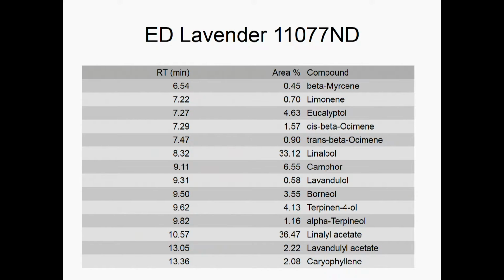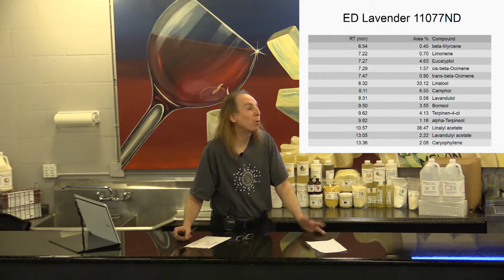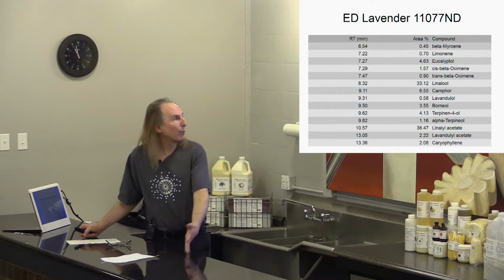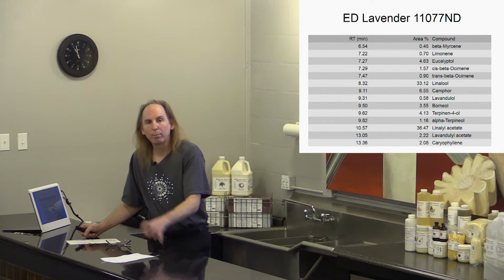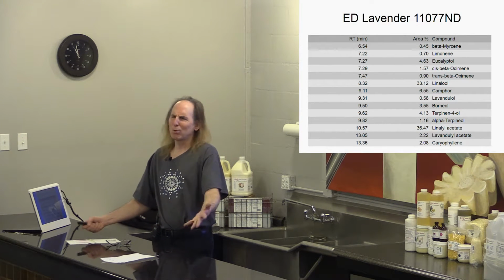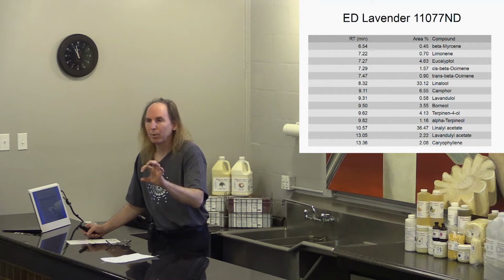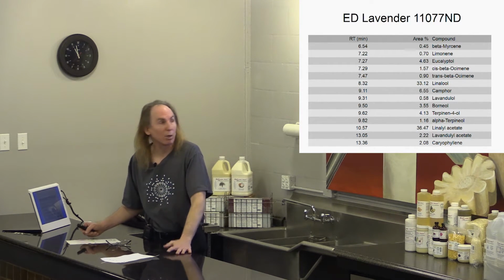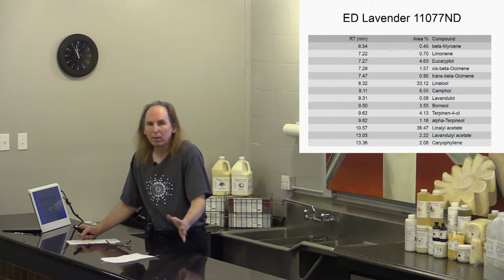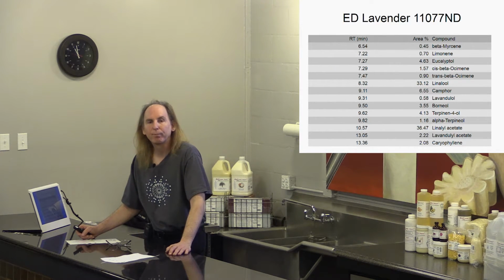There's going to be a little bit of slop. One of them might be 0.45%, one might be 0.46%. Would you say that's a problem? Probably not. If I got 0.45% from one bottle of the same batch and 27.2% from the other, something's wrong. That doesn't add up. And even if I took the same sample and injected it 12 times, would it always come out 0.45%? No, it's probably going to vary a little bit. There's going to be a little bit of slop from one measurement to another.